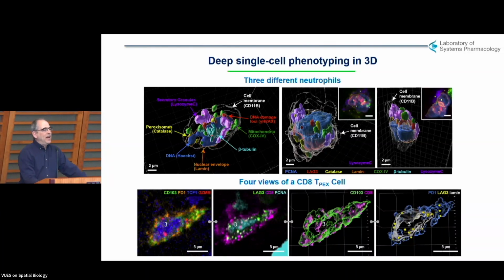And resolution is valuable in this setting because it allows us to look at function, it allows us to look at morphology, and remember, spatially morphology is a key feature. It's not just genes on an XYZ grid. It also allows us to improve signal to noise. All of those things get better with resolution, as this is illustrating.